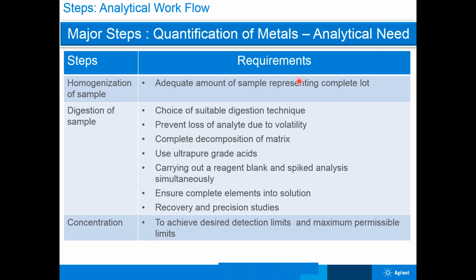Then we have to digest the sample. When I'm talking about the digestion of the sample, there are different types of digestion techniques available. Some regulatory bodies talk about ashing, a few talk about the Kjeldahl method, and nowadays the microwave digestion technique is also available in the market.